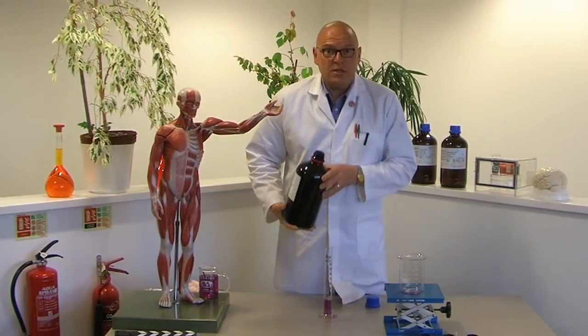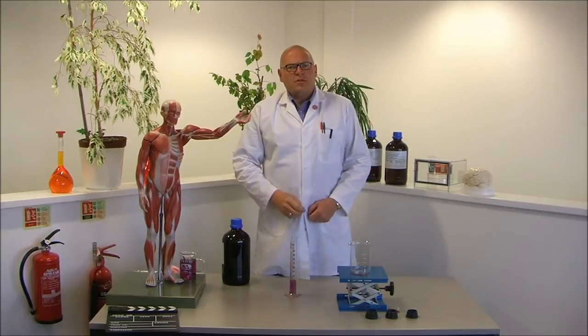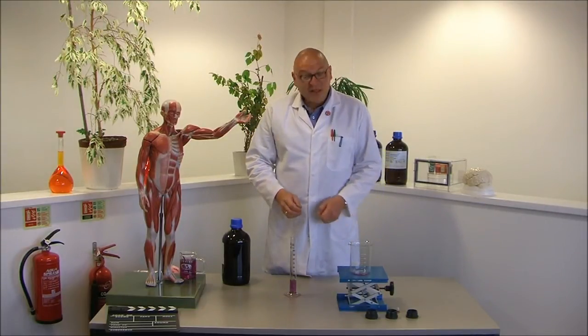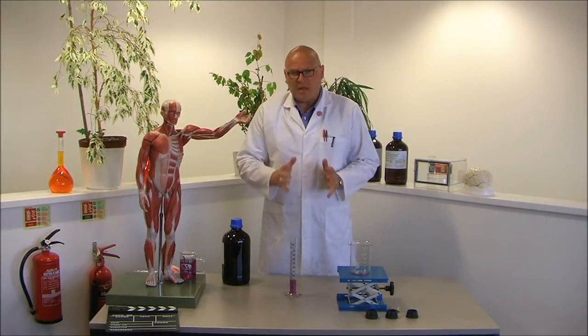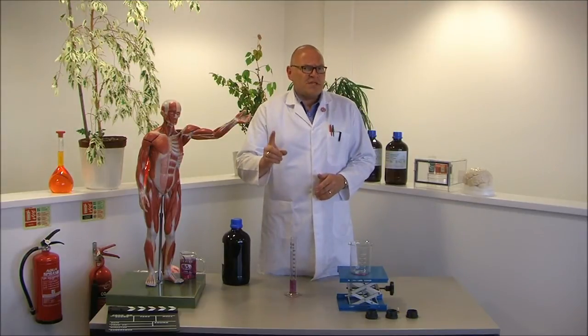Oops. It's gone all over the place. And then I come back. I apologise for that, ladies and gentlemen. That was my twin brother, the evil lab warehouse man, demonstrating how not to dispense liquids in the laboratory. Look at the mess he's made. Here at the lab warehouse we take safety very, very seriously.